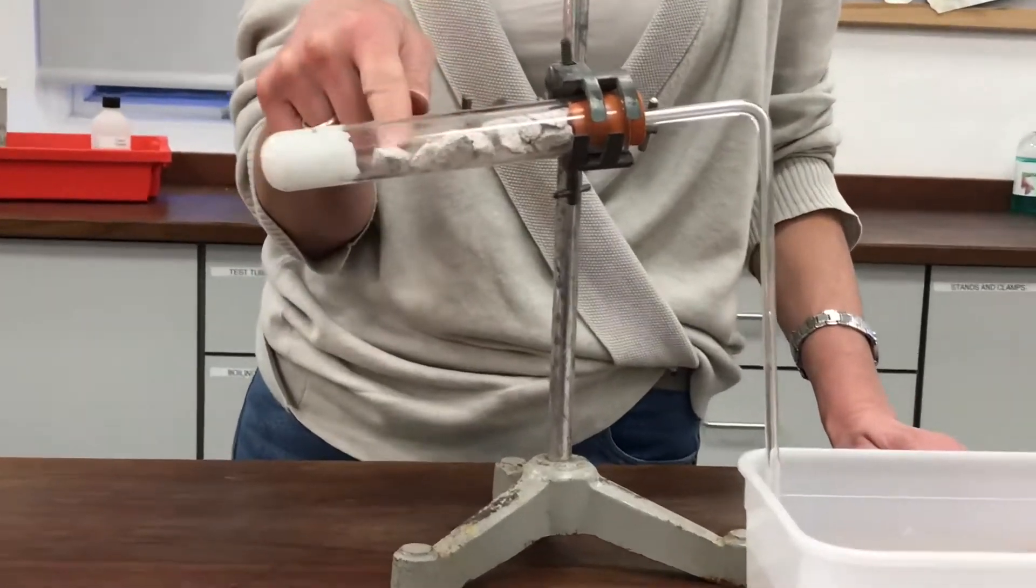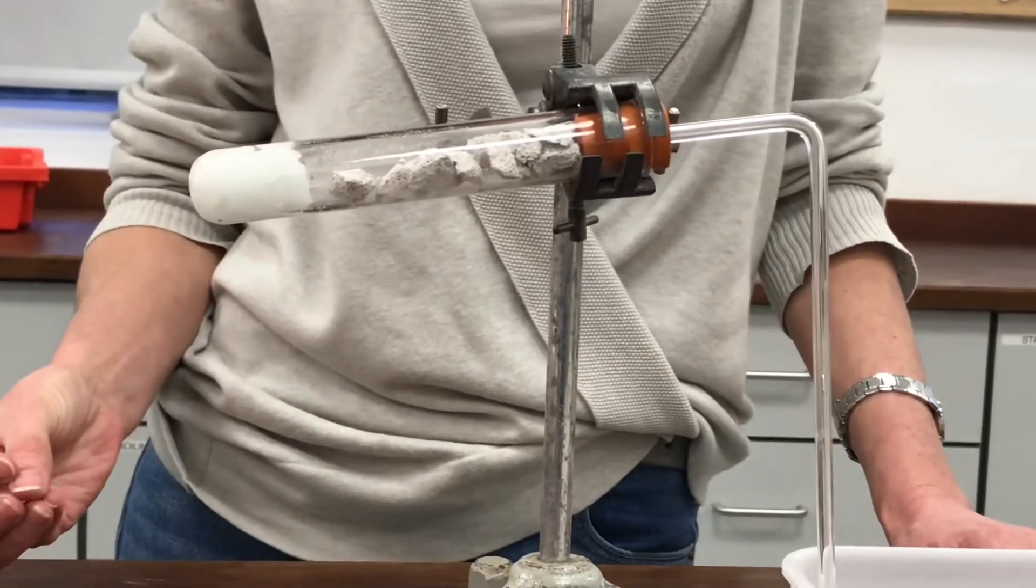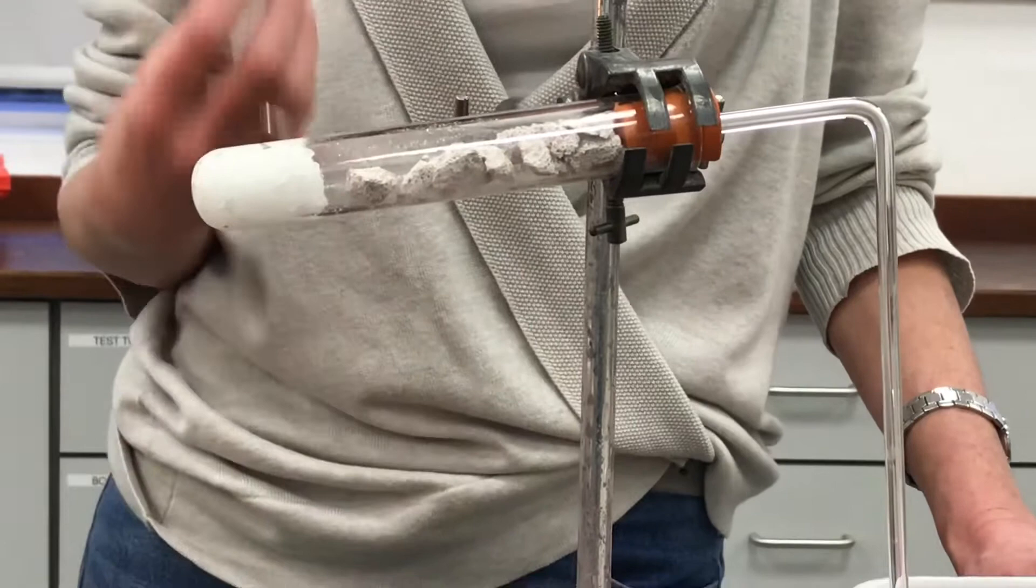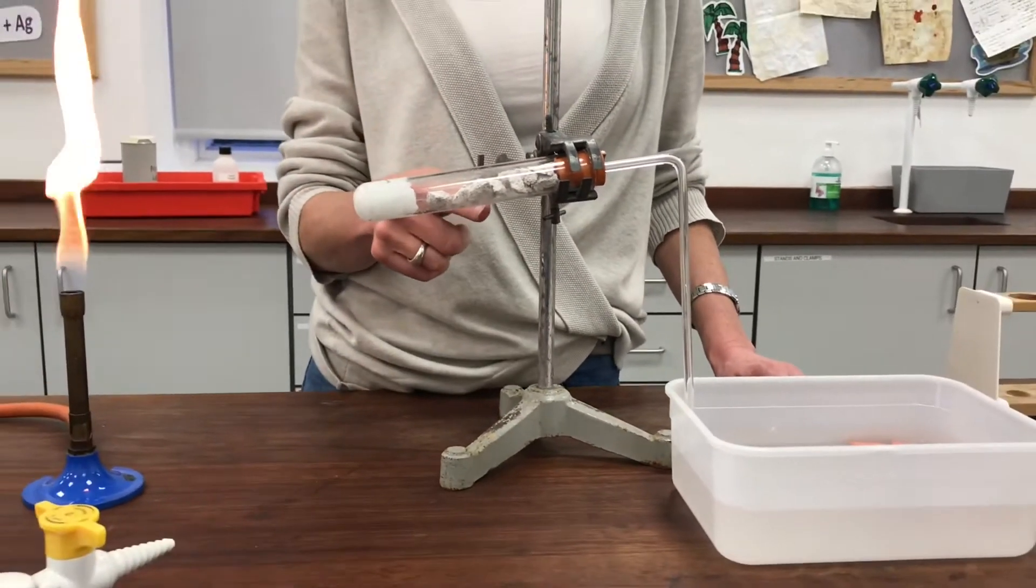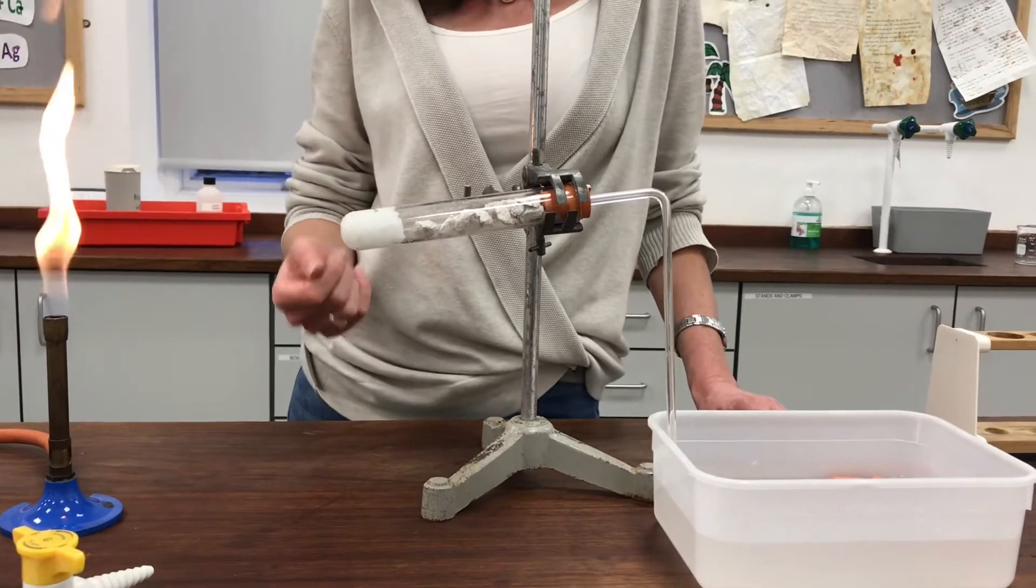The substance that I've got in there right now is pumice. I could also have used terracotta like you make plant pots out of or ceramic that's a broken up ceramic. Or if you want a proper chemical name to put in there I could use aluminium oxide which is also known as alumina or silicon dioxide which is also known as silica.